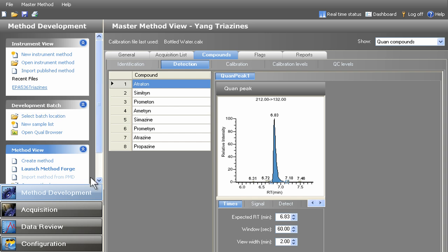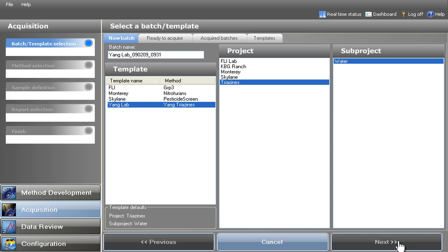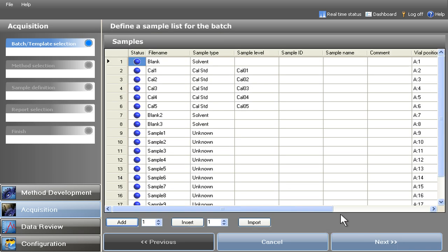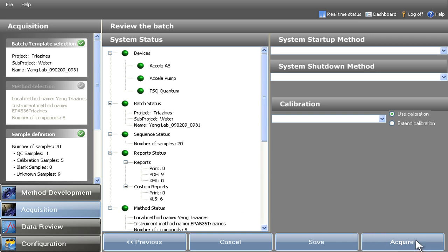TraceFinder's intuitive point-and-click interface makes it fast and easy to screen for routine contaminants, even for novice users. Choose the test, build the sample list, select the report options, submit the sample for analysis.